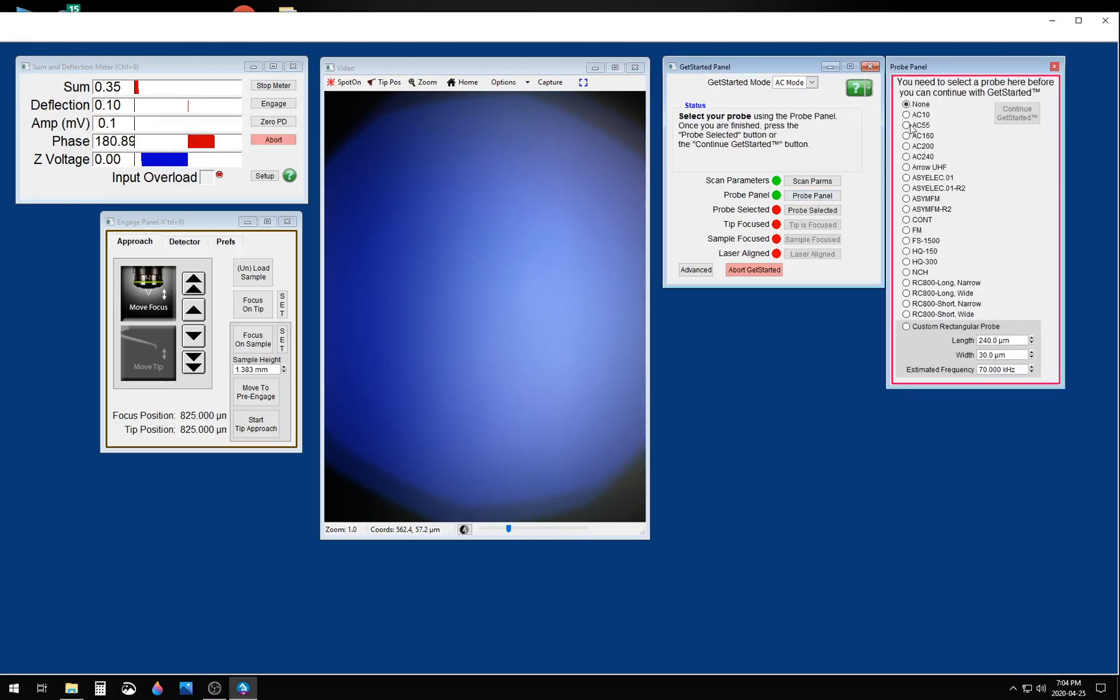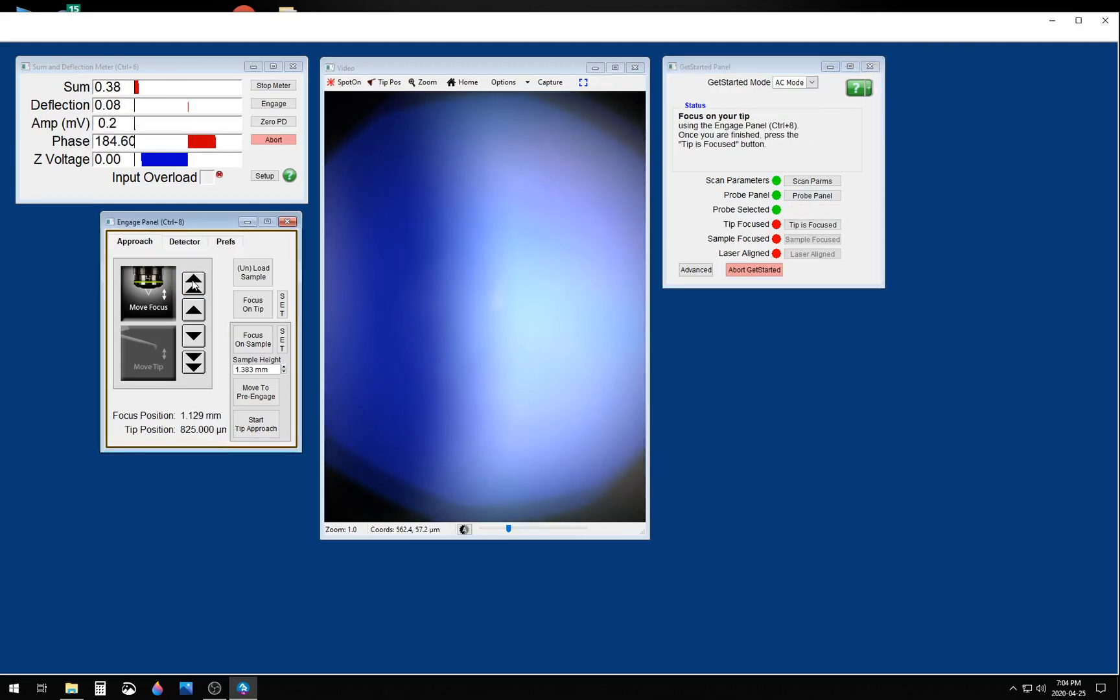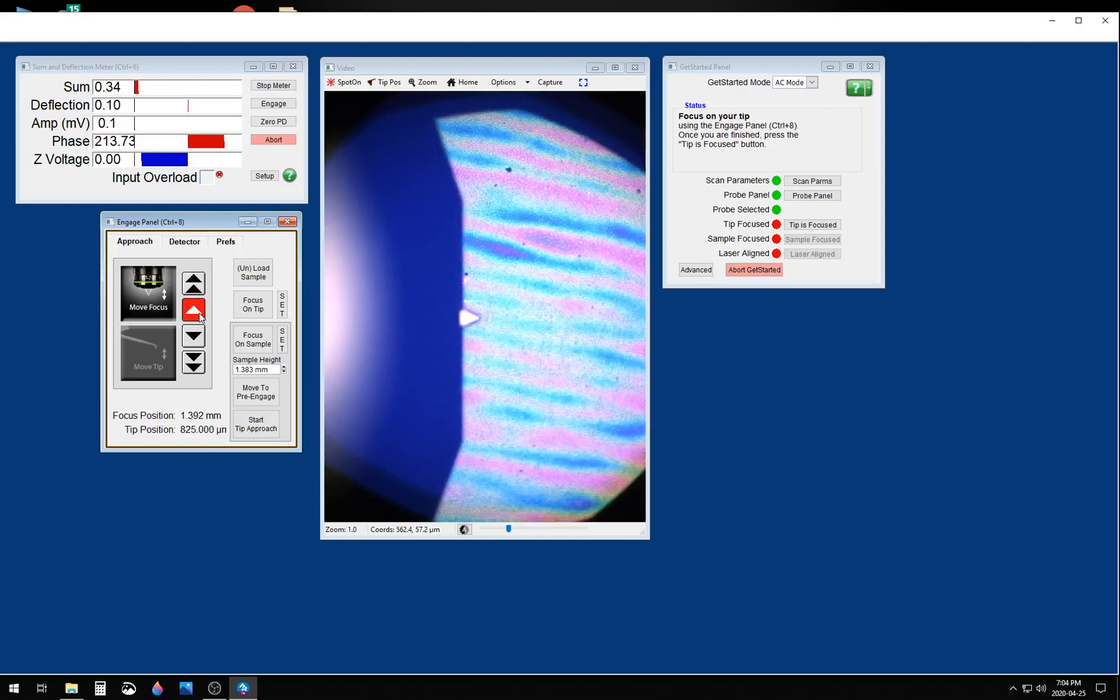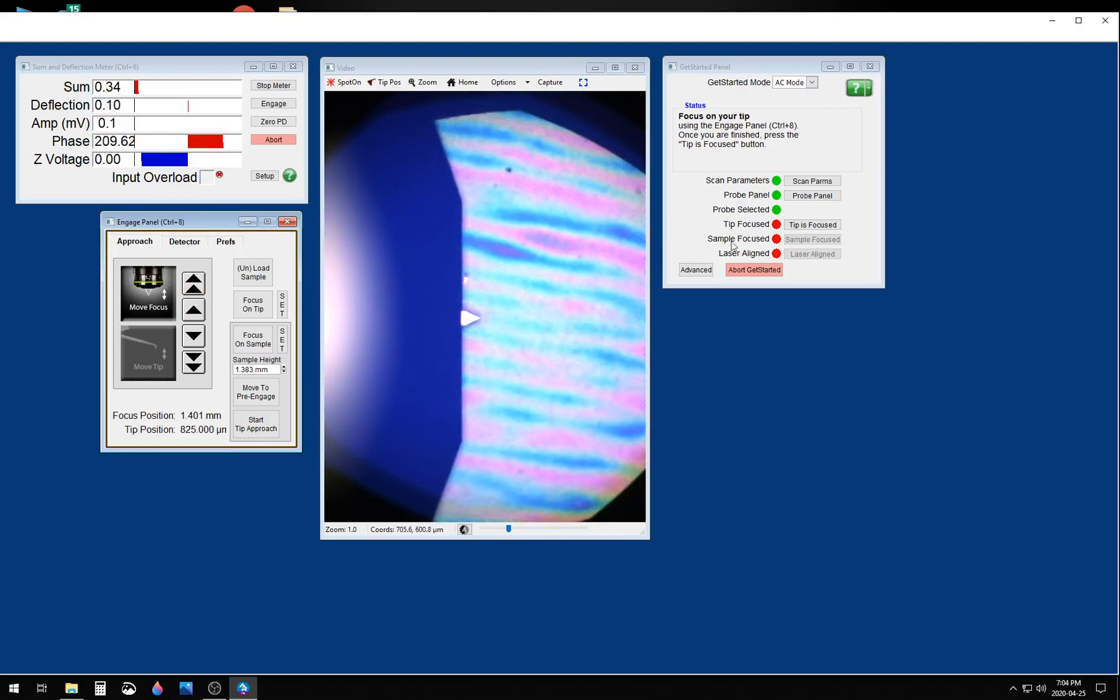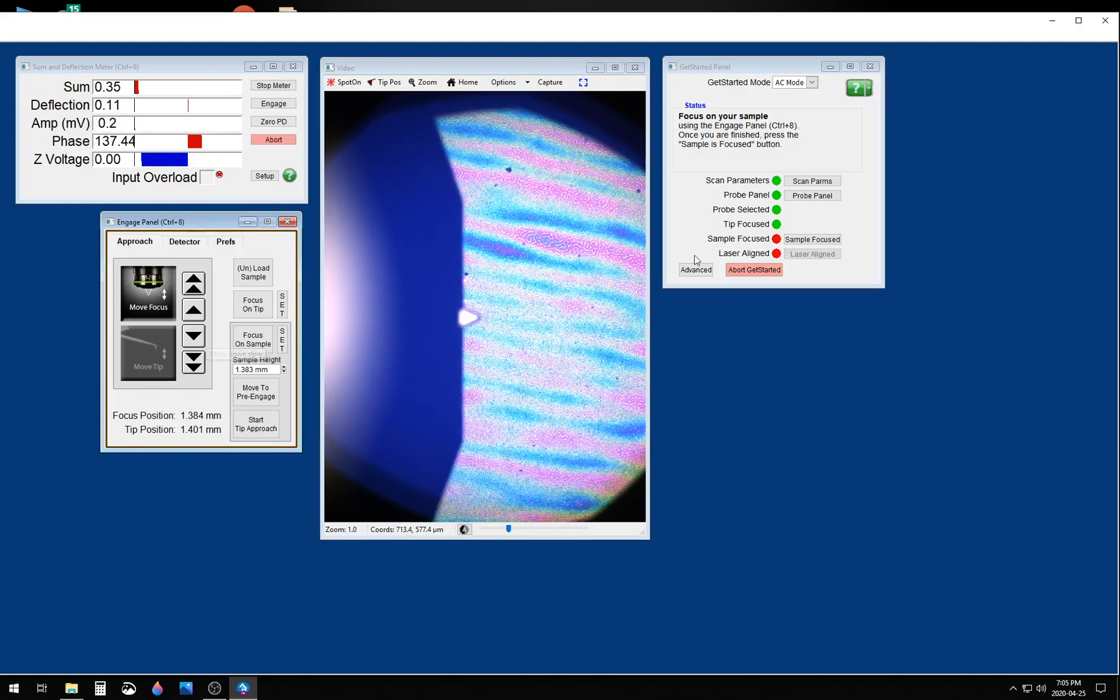Then you want to enter the tip that you're using in the probe panel, and locate the vertical position of your tip. You also want to locate the vertical position of your sample.